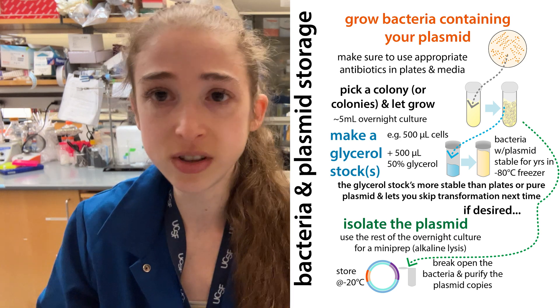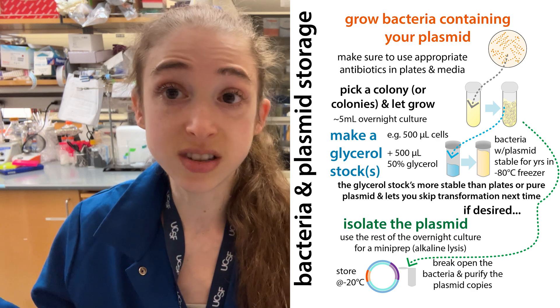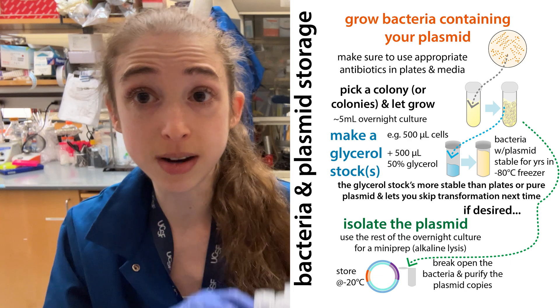It is really helpful — you can keep these in the minus 80 freezer for a long time and they should be good. Hope that helps, and happy preparing your glycerol stocks. And now I've got to do some mini preps.